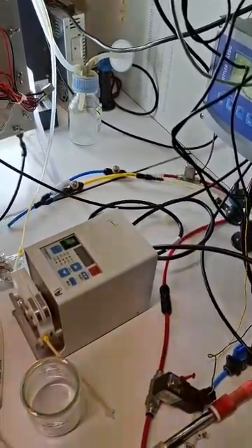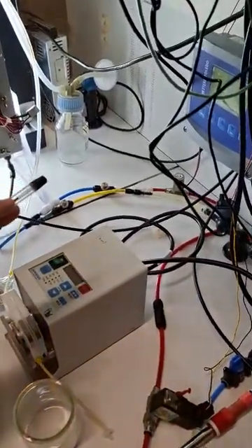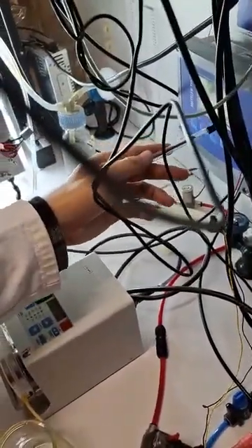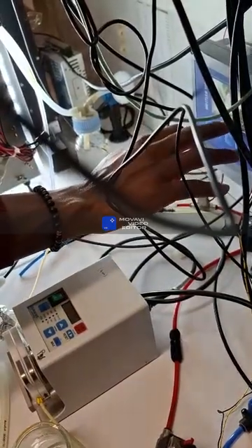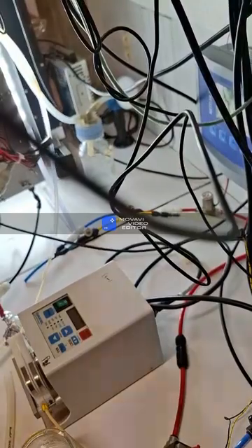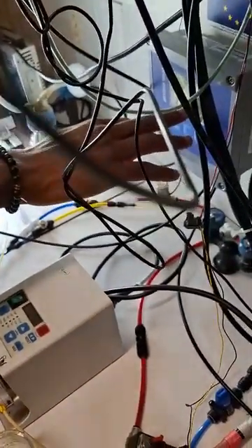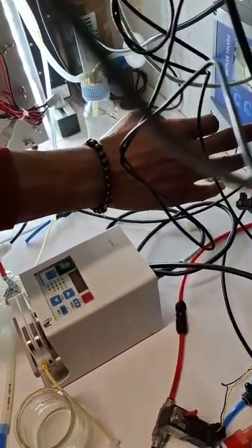This means the first one is probe and the second one is solution. Which one? Is this one probe and this one is solution? Yeah, this one is a real value. Yes, because we have two values, and that's the standard value. So we have to reach this value. For example, for me, it's okay. But it is fluctuating.